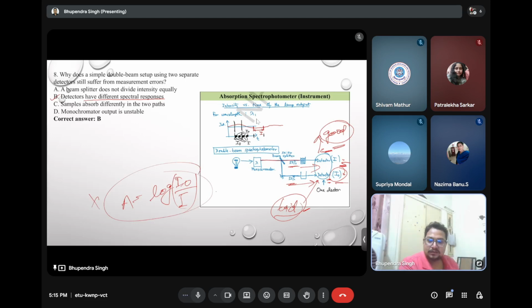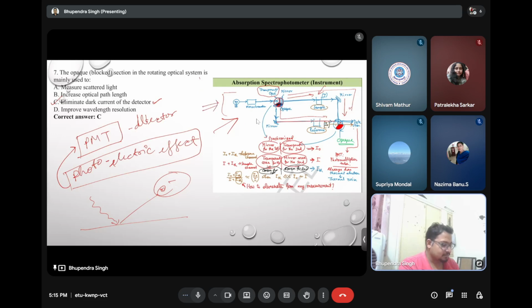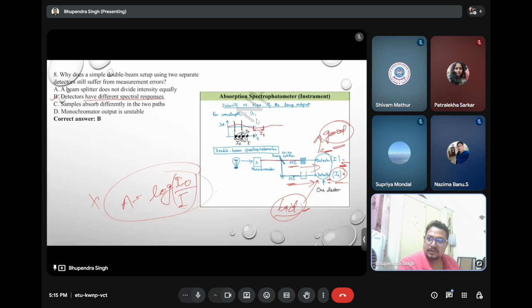And take my word for granted, no two detectors in the world are identical and have the same response. That is why this problem is here, and that is why we use this modern system. Fine. Okay, I think till here everybody is fine. Let's move to the next question. Is it fine, right?